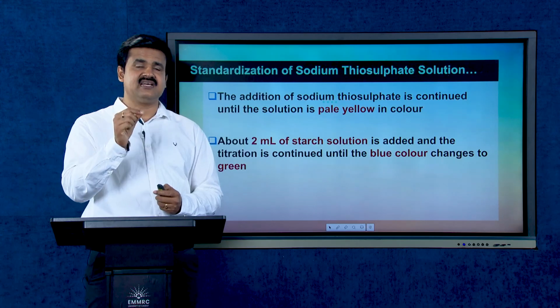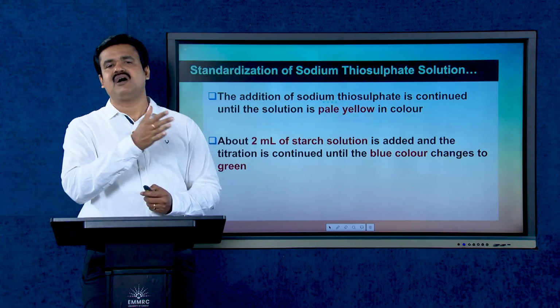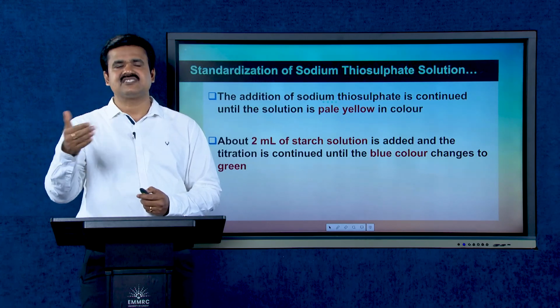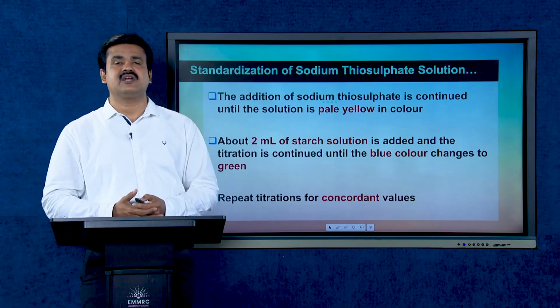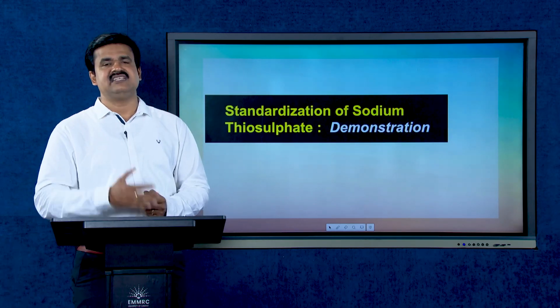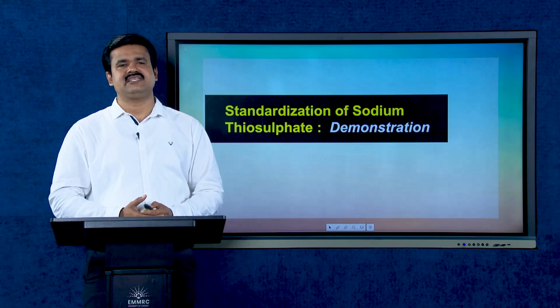Whenever you add the starch solution, a blue color develops, and you have to continue the titration until that blue color just changes to green. Now repeat the titration for concordant values. We are now demonstrating the standardization of sodium thiosulfate.